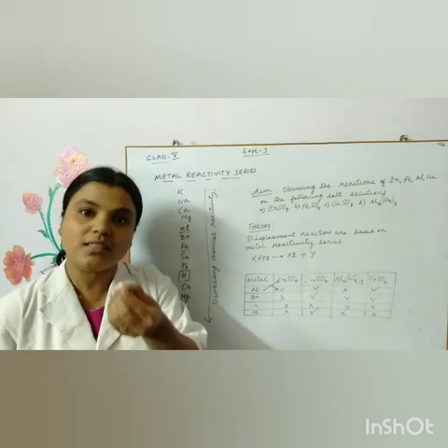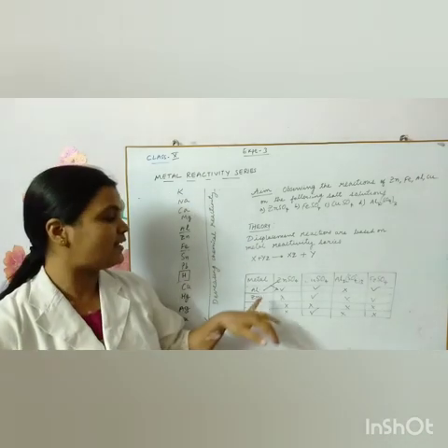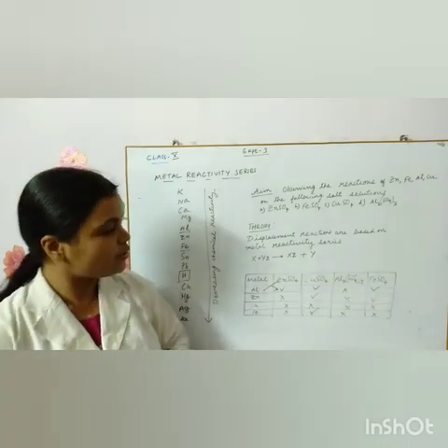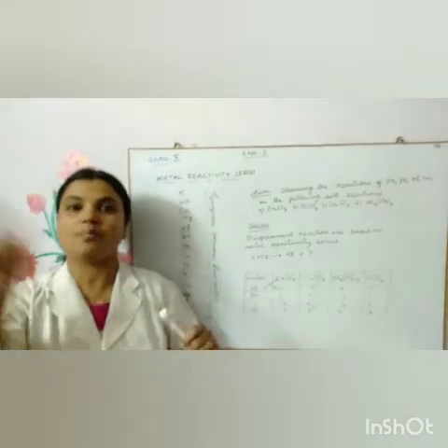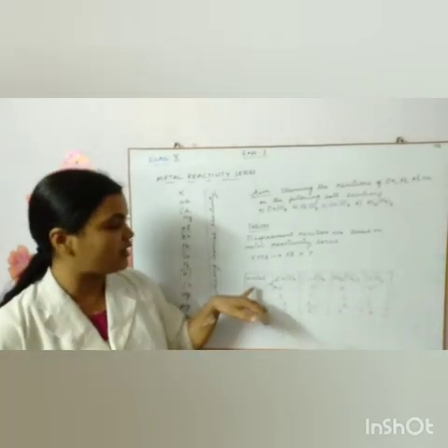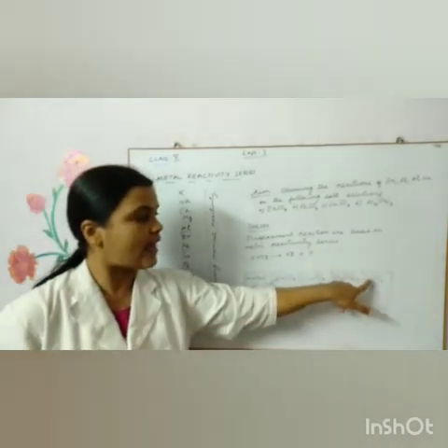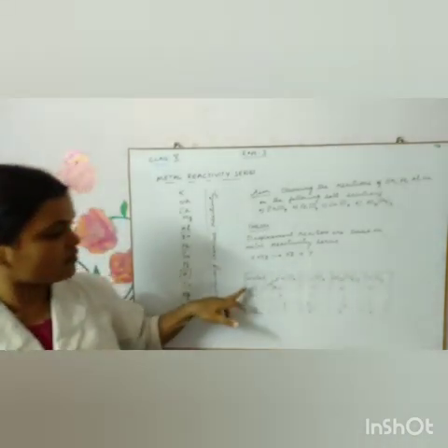And on the aluminium particles, you will see a dark brown colored coating, which shows that aluminium is more reactive. Can you see that in all three categories you got a positive reaction and observation? So we can say that aluminium is more reactive than zinc, than copper, than iron also. So this is on top.